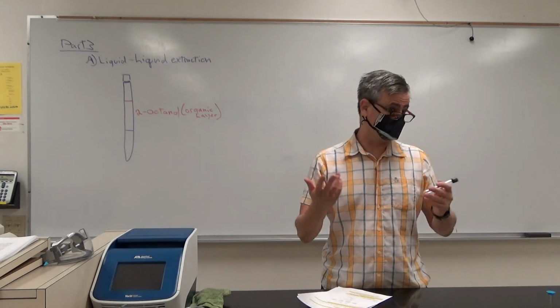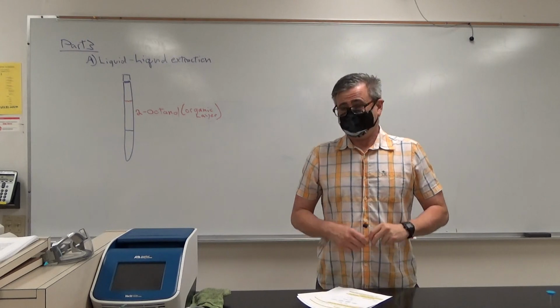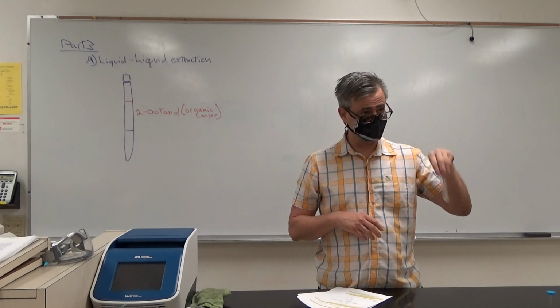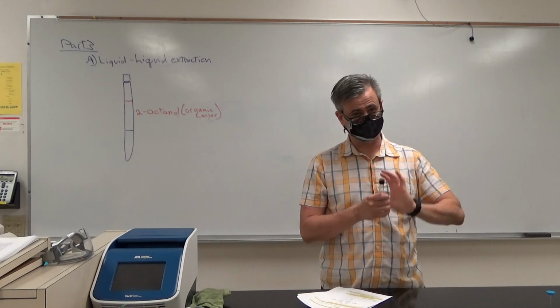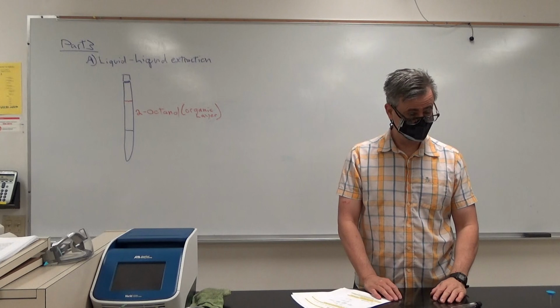That helps. You could wait, just like salad dressing. Eventually, it'll separate again. You could wait, but to hurry up that separation, the centrifuge will make the more dense stuff go down, the water, and less dense stay up. So we're gonna shake it a bunch and then centrifuge it?